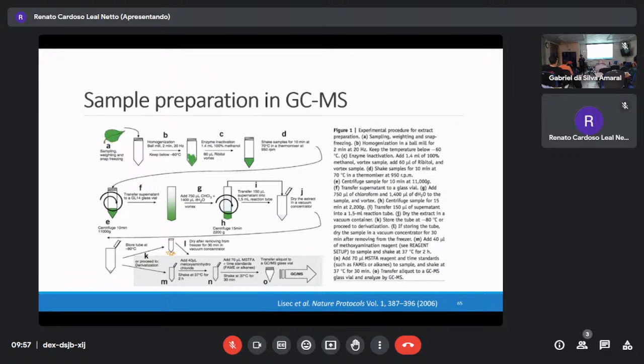In that case, for GCMS and LCMS, you add methanol and chloroform, and the organic part they throw away, because in LCMS cases, chlorophyll always causes column contamination. After that, the methanol part is used. GCMS is also the same. Although GCMS is done with volatile compounds, sugar is non-volatile, but after derivatization, of course, it's volatile. Then take out the chlorophyll part, and then they use this. After that, TMS derivatization. This is the method. Of course, it's a very complex one.